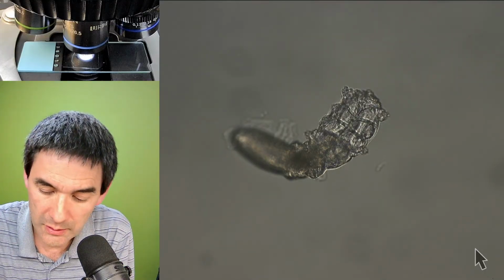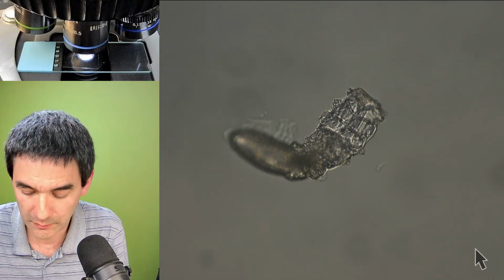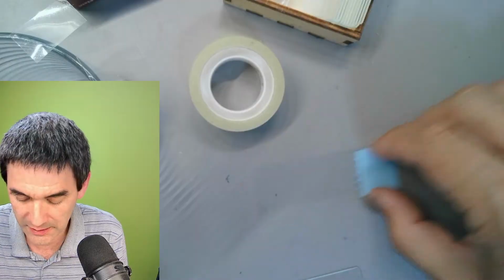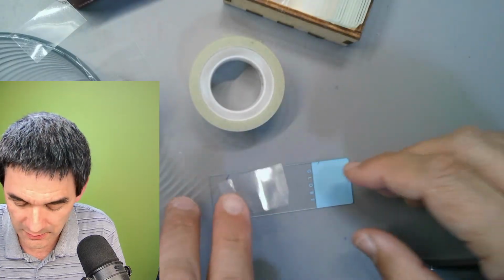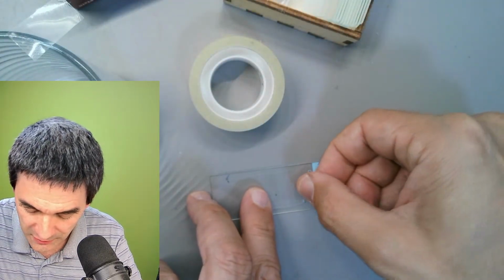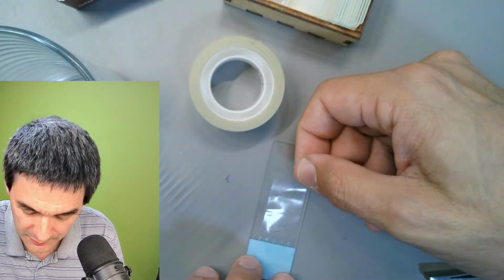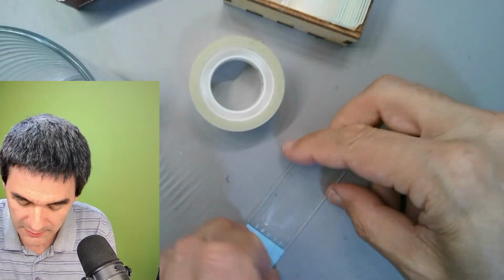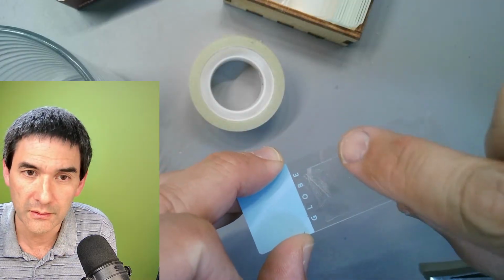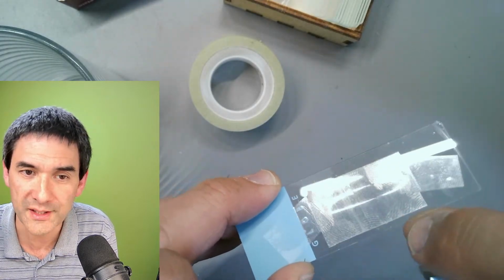You take a microscope slide again. I'm going to show you here quickly by switching over to the desk view. Oh, I already have a slide here. Sticky surface to the top, and you use 2 pieces of tape to secure this tape here. And here in the center, there is a line where I collected the face mites. Hopefully there are a few present.